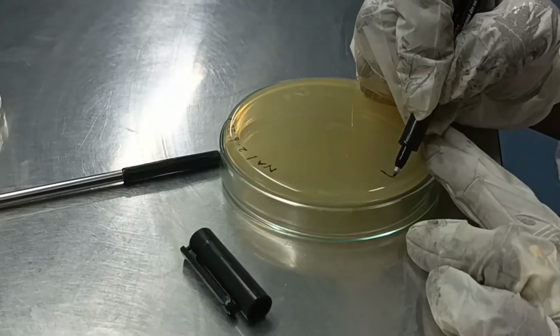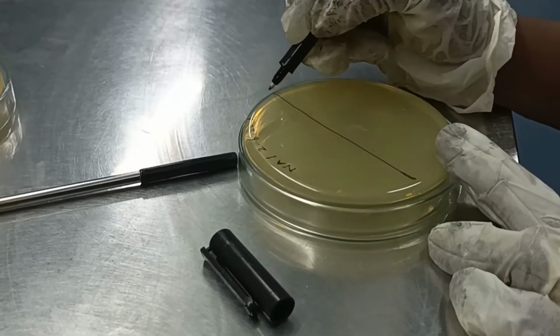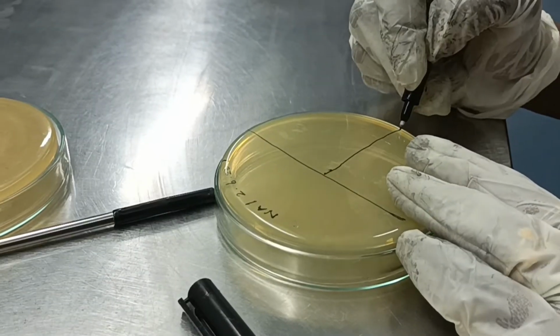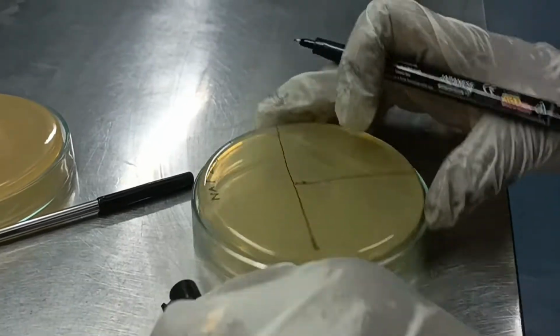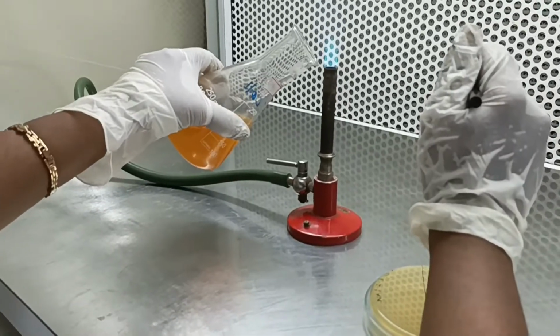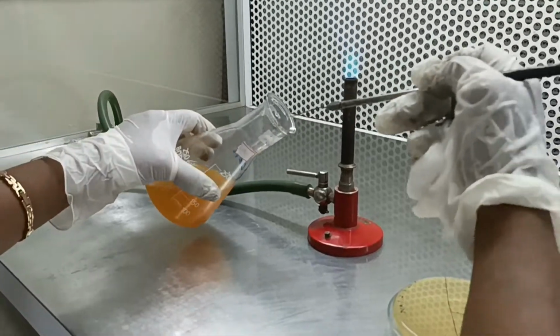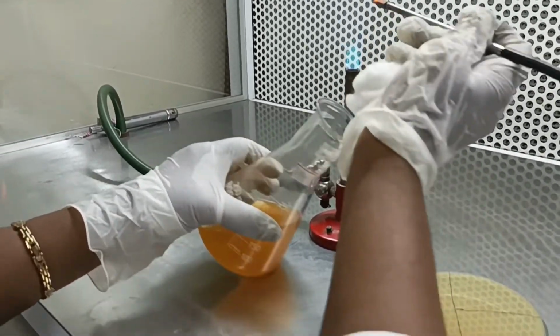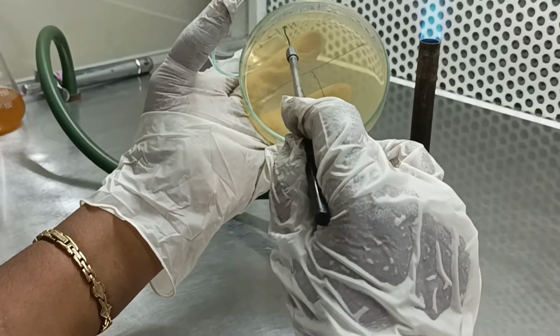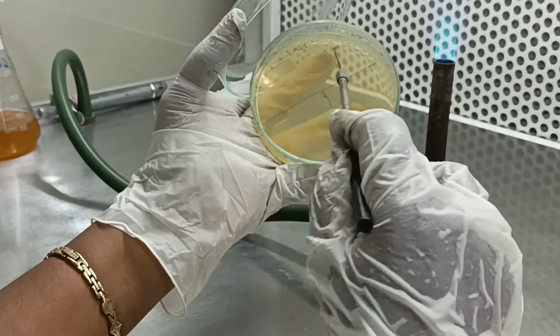Next one, T streaking. A T shape is drawn on the bottom surface of the plate using a marker. Take 1 loopful of inoculum from the broth. Place the inoculum on the top of the agar surface. Track the loop with suspension in a zigzag pattern in the top half of the T.